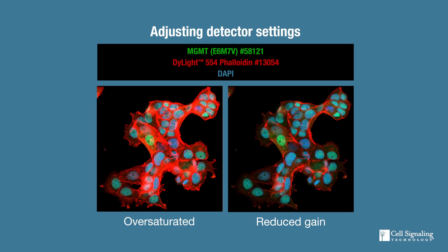Finally, if the signal is specific but really strong, it can saturate the detector, losing dynamic range, and may also cause spectral bleed-through to another channel. If this happens, you can try using less antibody, or simply adjust the exposure time or laser power to take advantage of the full dynamic range.